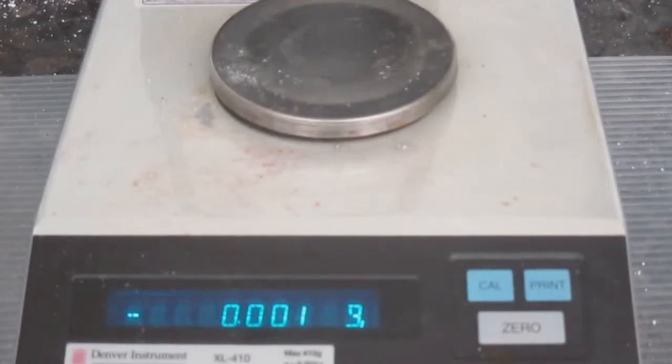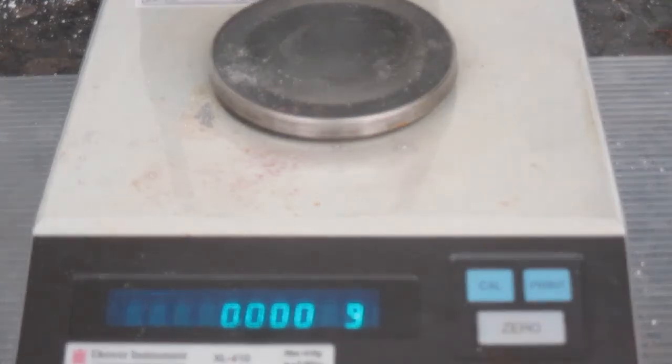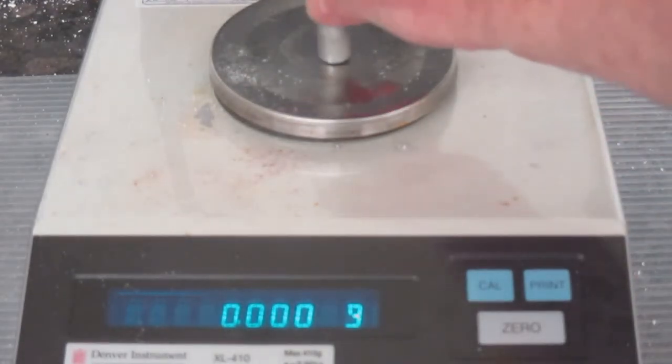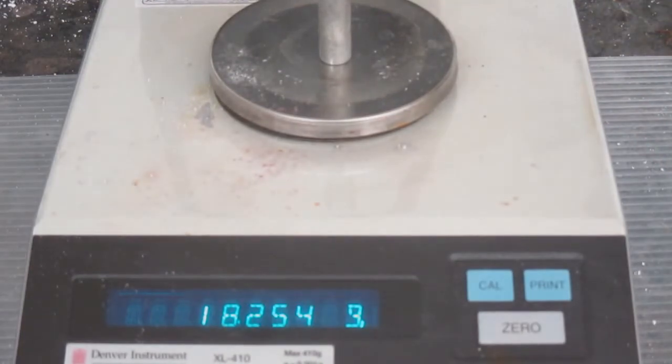For this experiment, we're going to be looking at the specific heat or calorimetry of certain metals. I have a scale, and I'm going to zero it and record the mass of this aluminum cylinder.